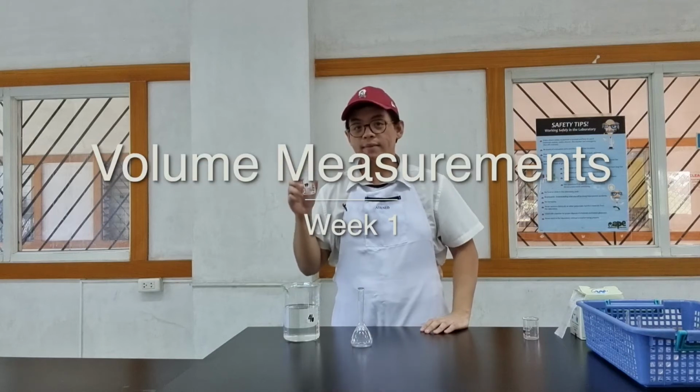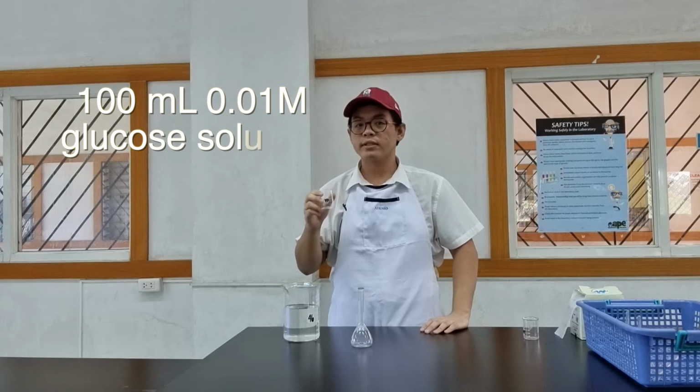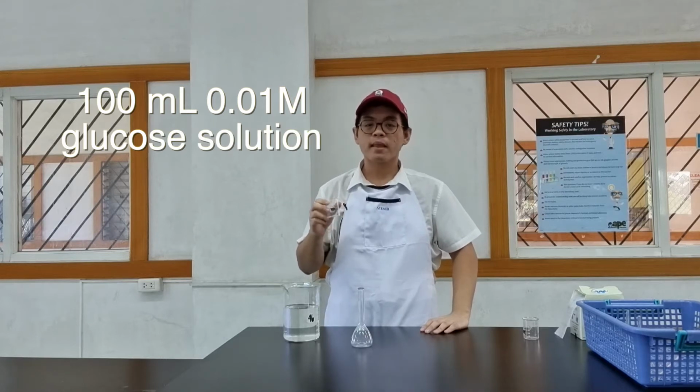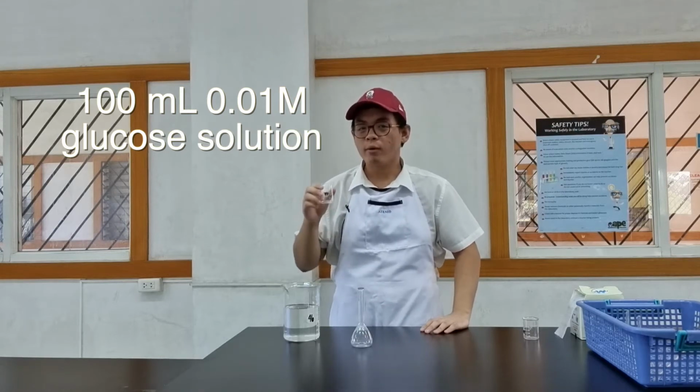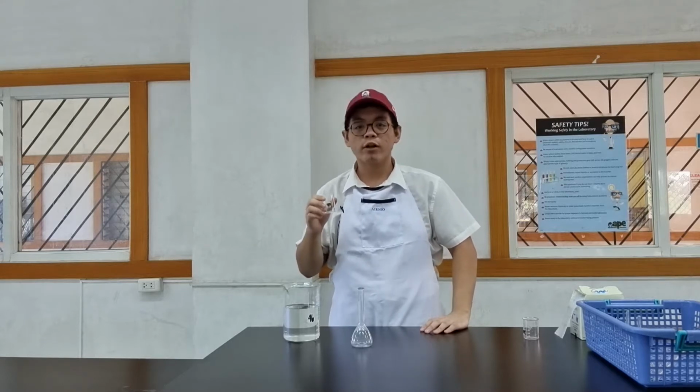So now that I have my solid, I'm now going to make my 100 ml of roughly 0.01 molar solution. Now, before I continue, I want to introduce some key glasswares for measuring volume first.